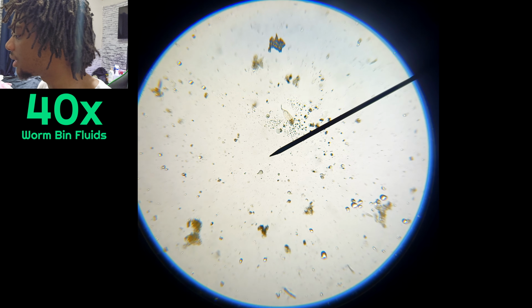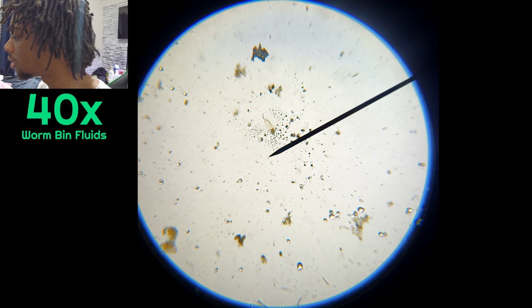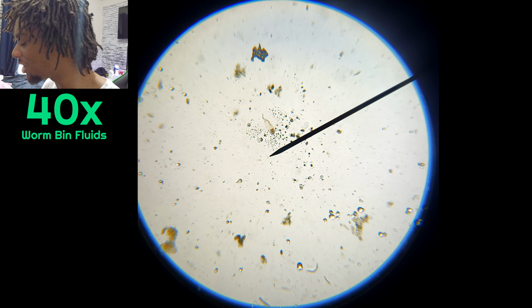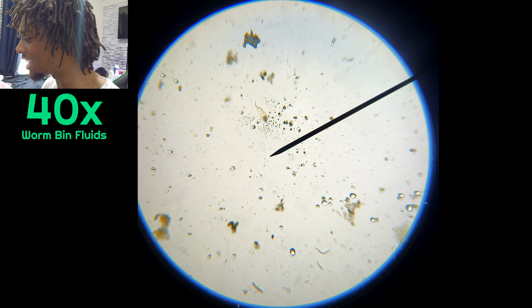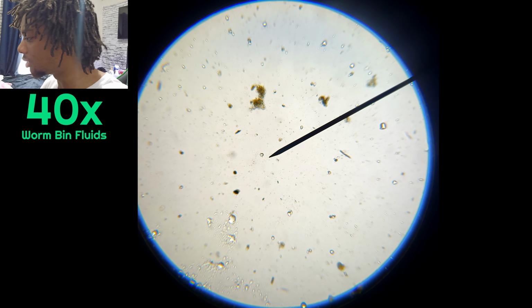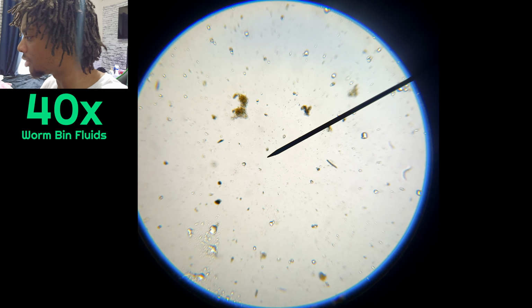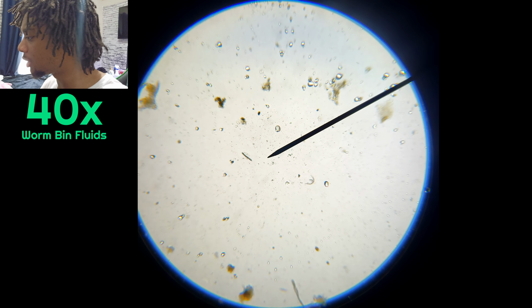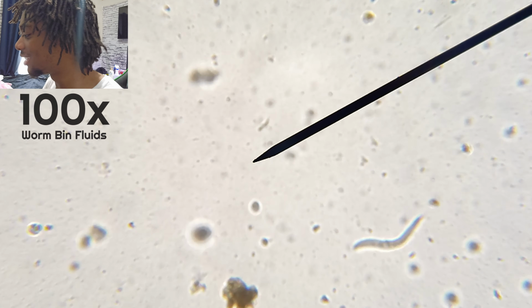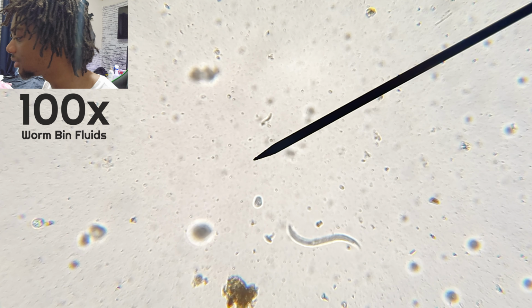What is that right there? Oh, no. Look at that. Is that a nematode? Hold on. Look at that. Let me get a... Hold still, you little freak. Come here. No, you don't. Come here. Get my eyes on you. Look at that right there. Got me a nematode.